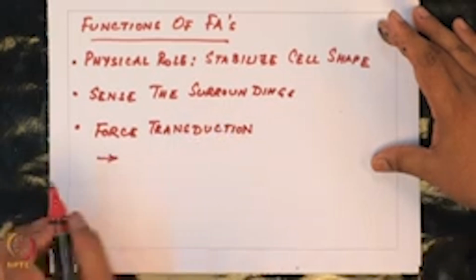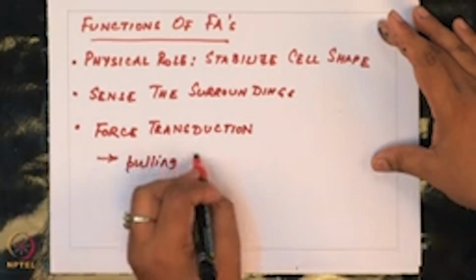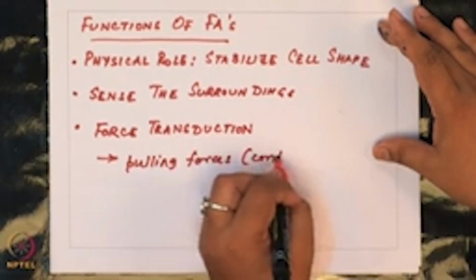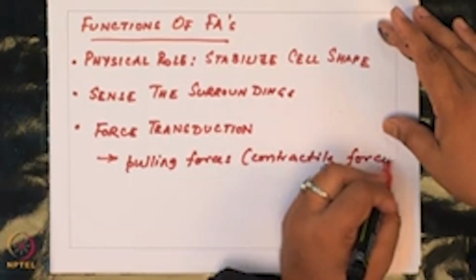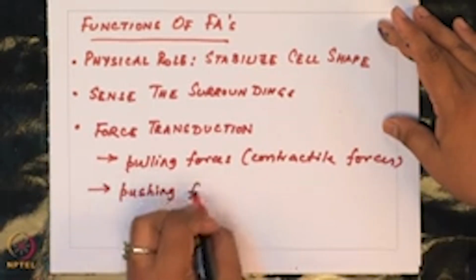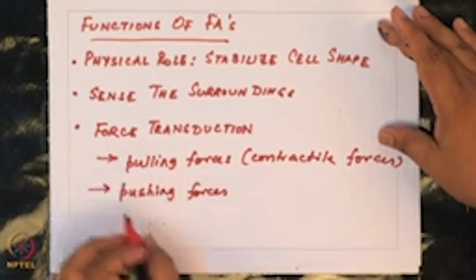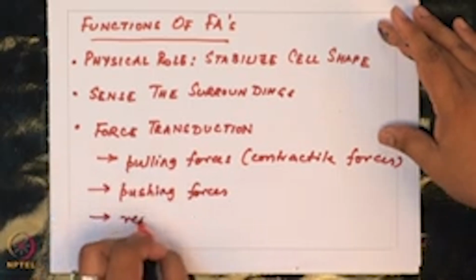Okay. So, you can have pulling forces, that is contractile forces, you can have pushing forces, and you can have remodeling.